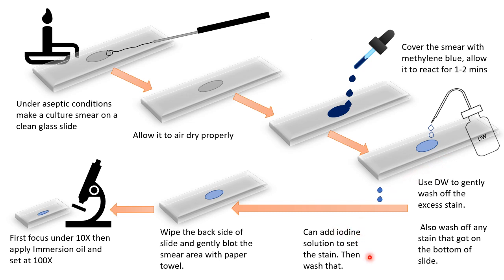As an extra step found in some textbooks, iodine solution can be added to set the stain and then washed off, but you can also skip this. Then wipe the back side of your slide and gently blot the smear area with a paper towel — be careful not to wipe off the smear completely. First focus your slide under 10x on the microscope, then add a drop of immersion oil and adjust to 100x to observe your slide.